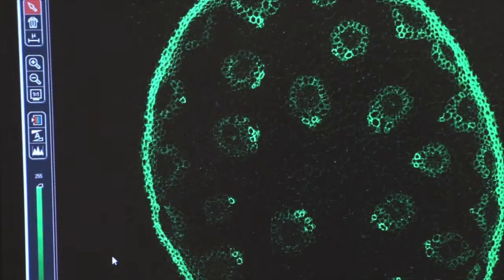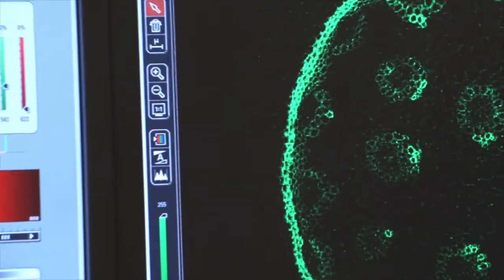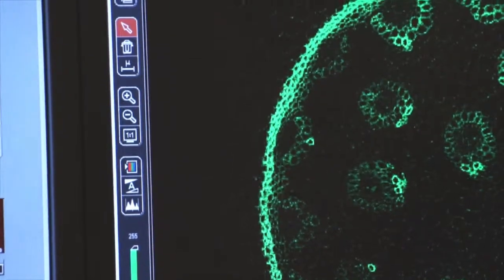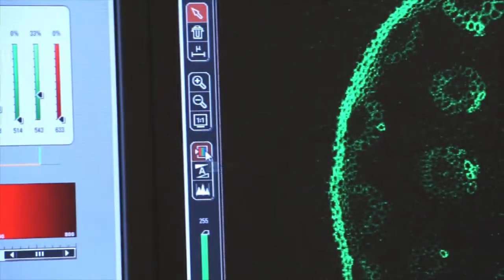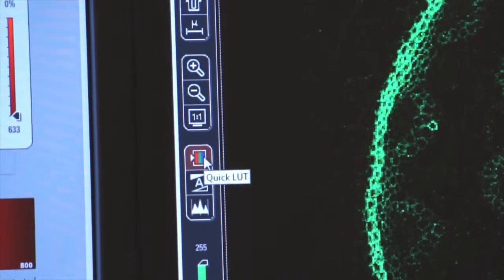We now have a live image on the screen and I want to show you an easy way to set the gain and the offset so that your images are the crispest they can be. If you click on this little box here, this is the quick lookup table.